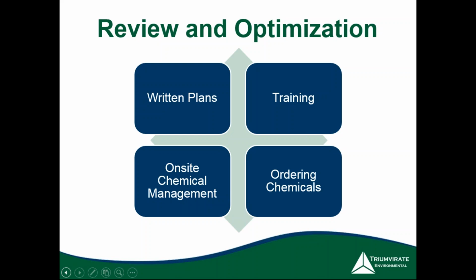If they understand why you're doing the inventory, why it's important, and they have accessibility to the plans and the training, they'll order through your channels, and we'll be able to make sure that stuff gets inventoried as it comes in, and that'll help quite a bit.